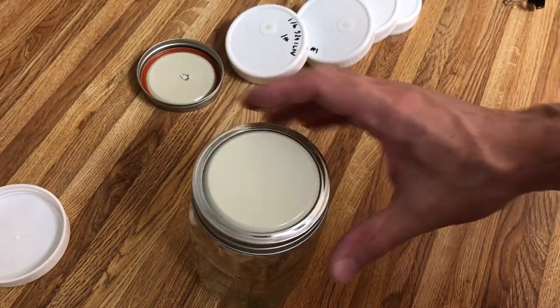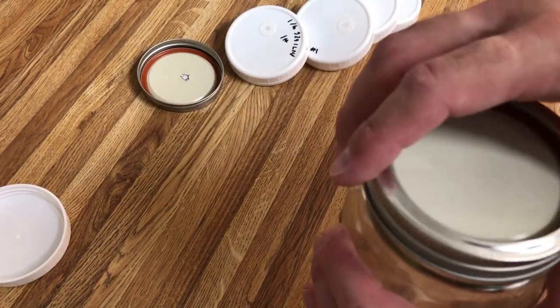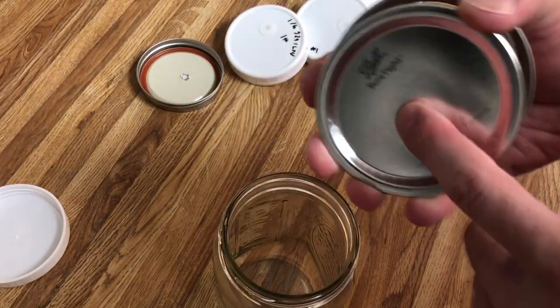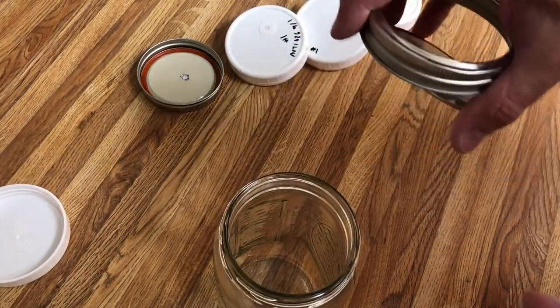The only issue with using metal lids is if you're doing grain to grain transfers, because there's multiple parts and they're kind of slippery, you know, you don't want to be touching the bottom of this because you'll contaminate your grain to grain jar, right? So you just have to be really careful doing grain to grain, which is why I prefer plastic lids.